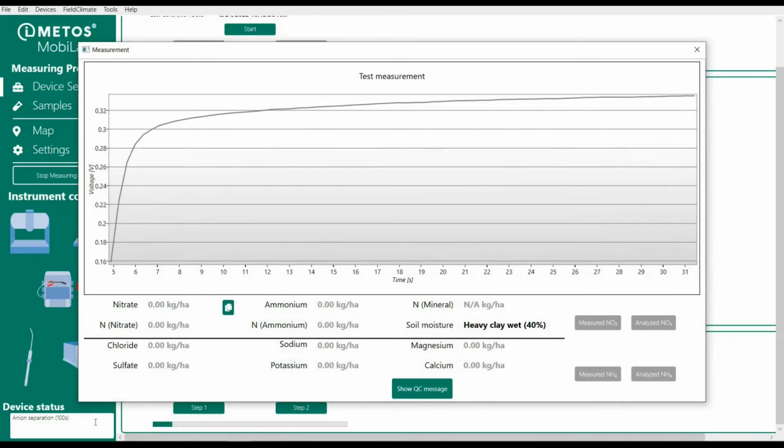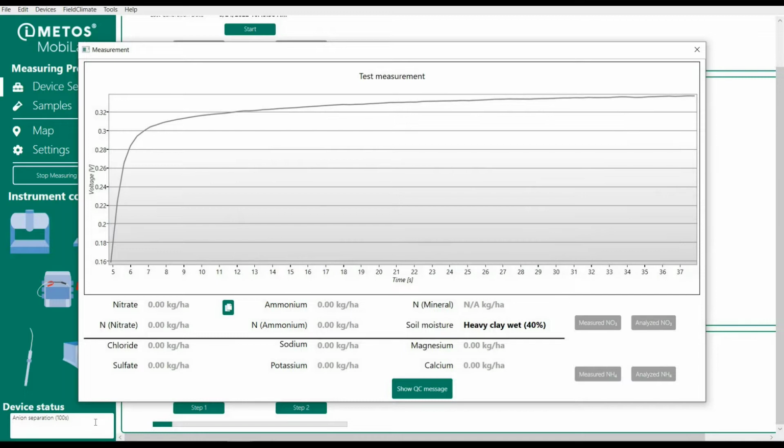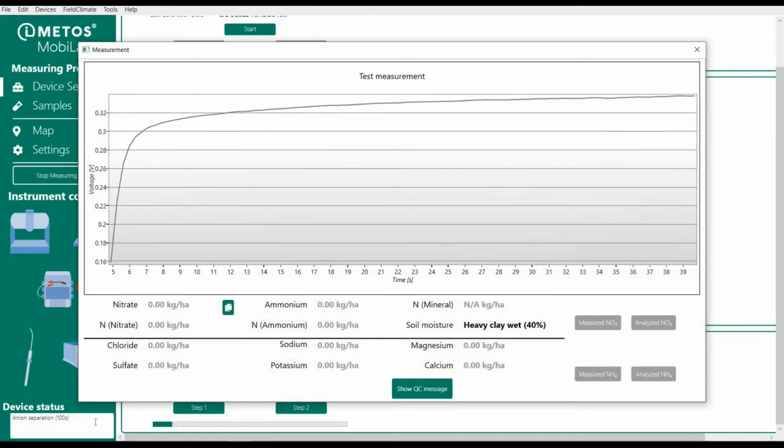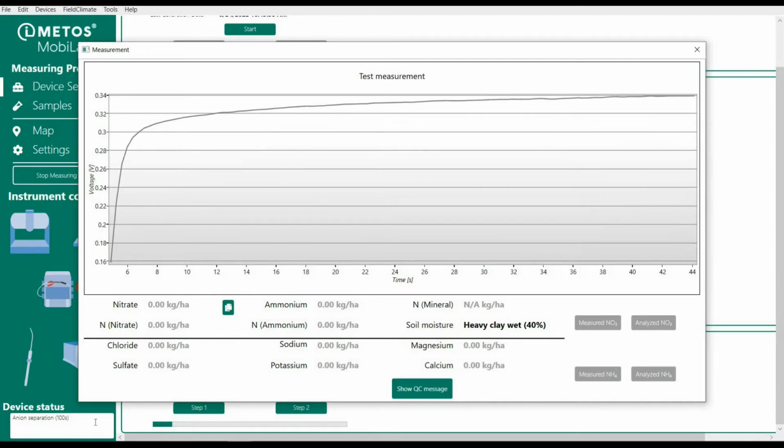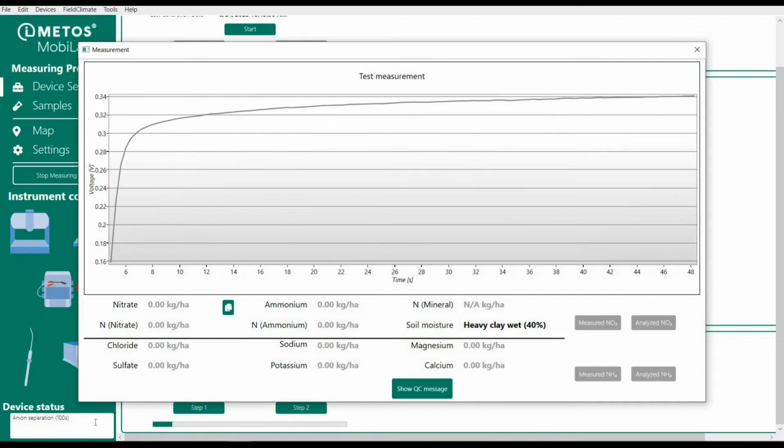As the device is very sensitive during the measurements, sometimes minor disturbances will take place. Therefore, make sure that you do not touch any cables during the measurement. The device is placed horizontally on a stable place, and no other machines or devices can interfere with the measurement.